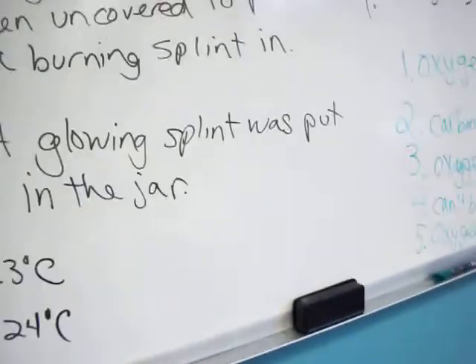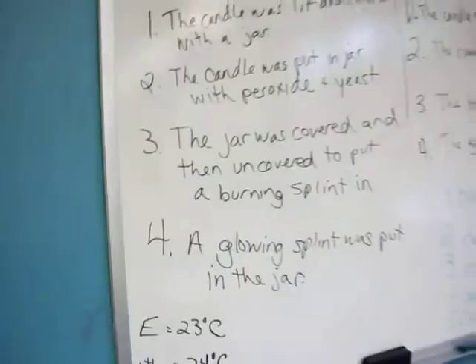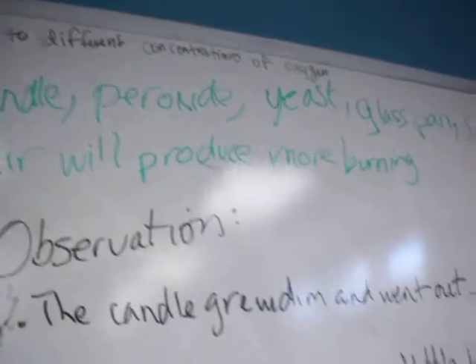Okay, so we've added an objective since the camera stopped running to see how fire reacts to different concentrations of oxygen. And I'm going to hand the camera over to Clay, who will surely do a better job than I've been doing. We've definitely seen burning increases with an increased concentration of oxygen, no doubt.